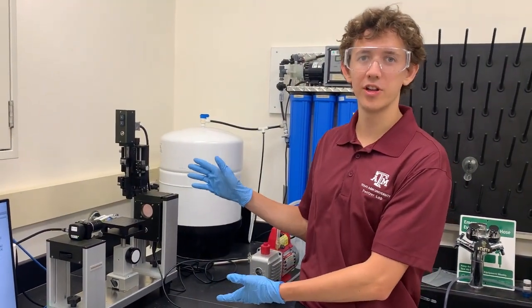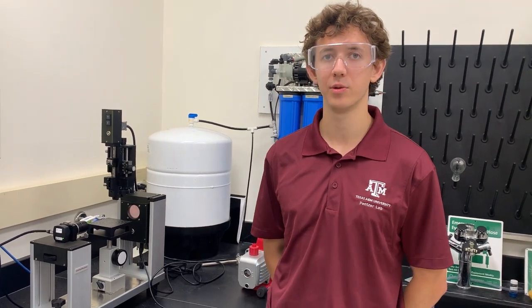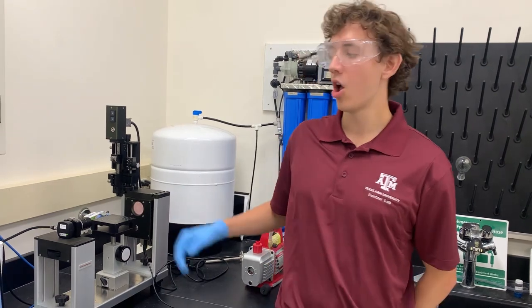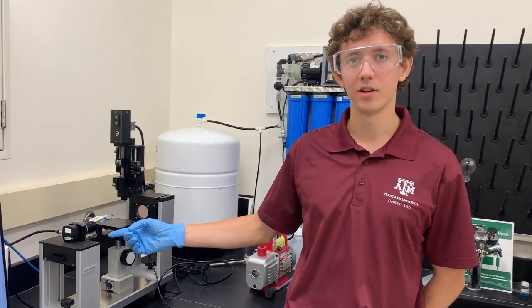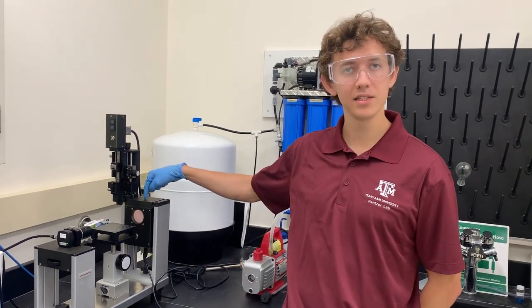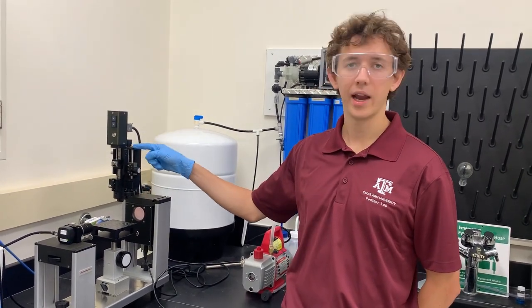This is a goniometer. We'll use this instrument to take zoomed-in images of a droplet suspended from a needle in another fluid phase. The primary features of the goniometer are its zoomed-in camera, position-adjustable stage, light source, and dispensing system.